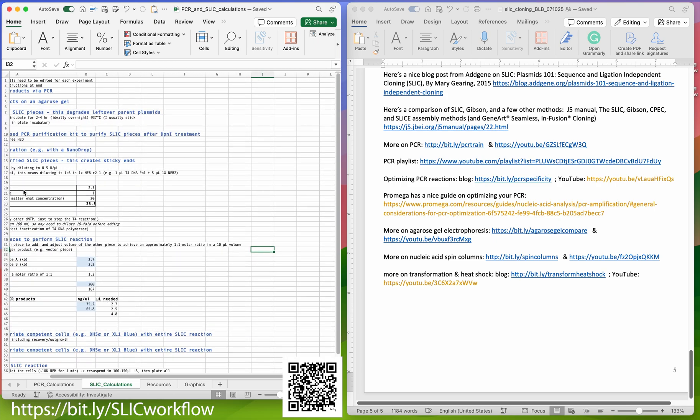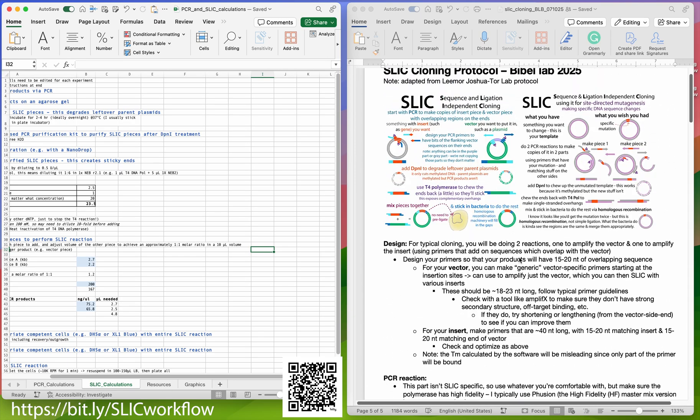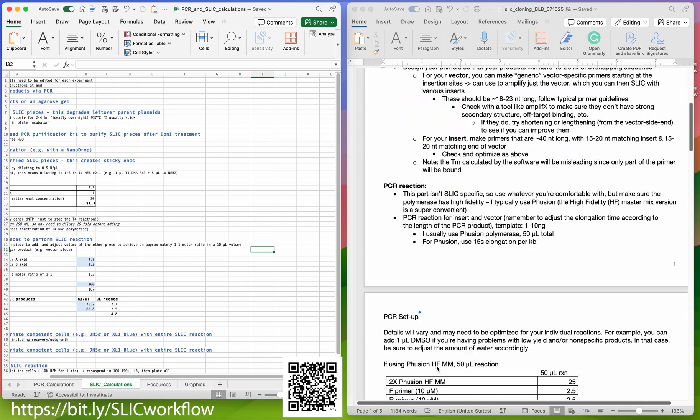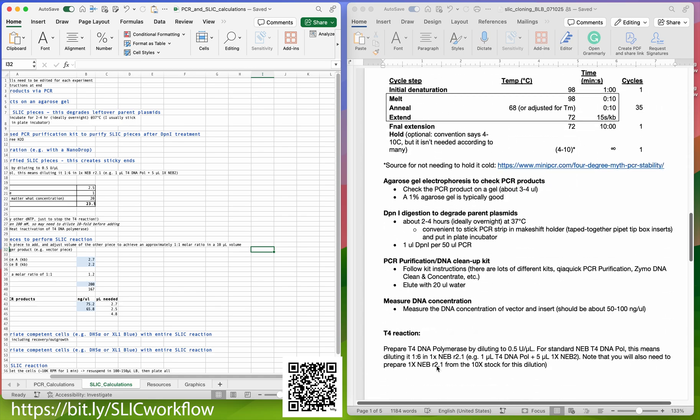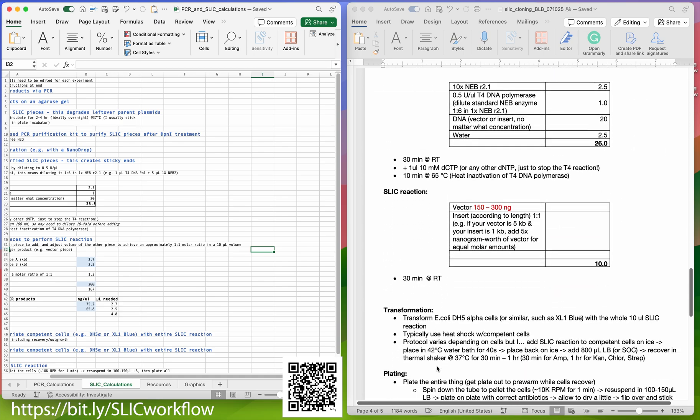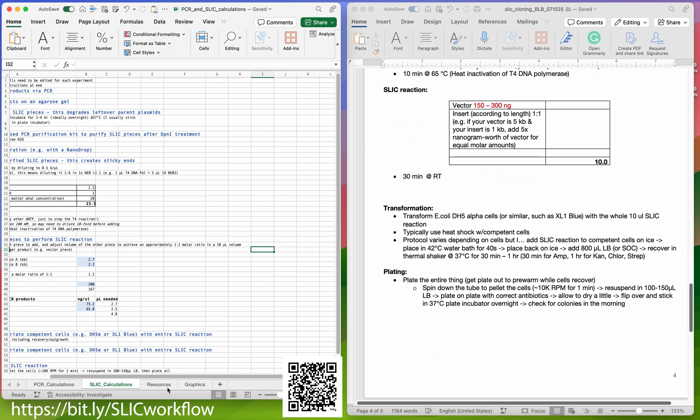This is how it does the calculations, and then here is a more detailed guide of things like how to design your primers, how to optimize your reactions.